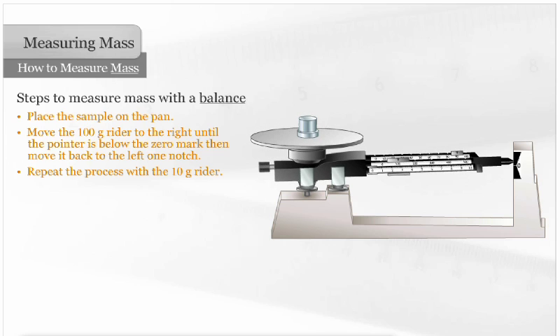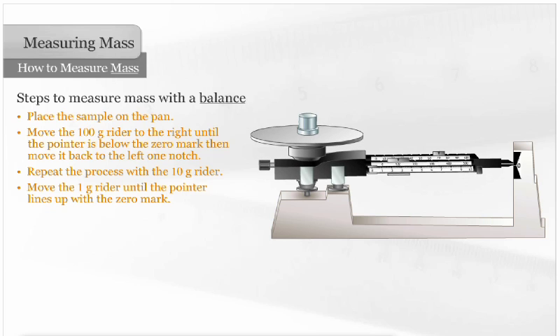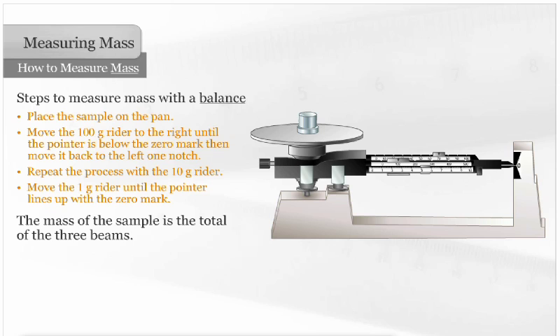Repeat the process with the 10-gram rider. Move the 1-gram rider until the pointer lines up with the zero mark. The mass of the sample is the total of the three beams.